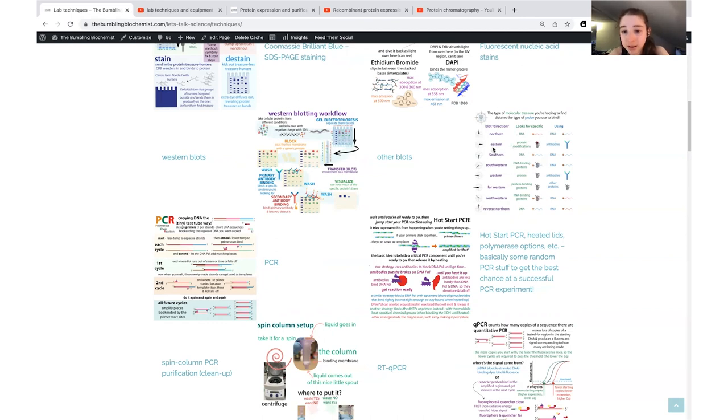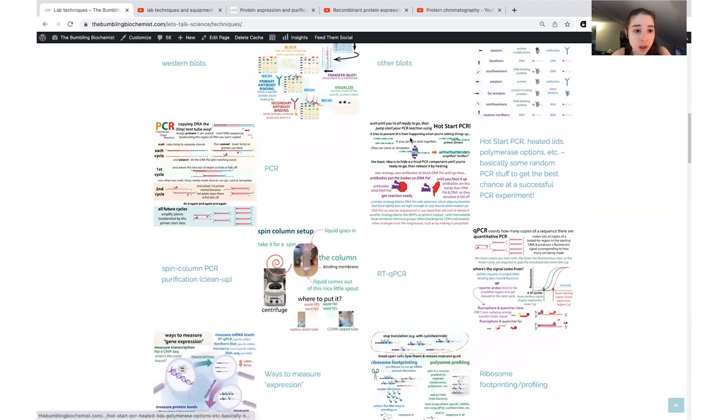And the Southern blot is actually the original blot, where you have DNA. You'd run either some sort of PAGE or agarose gel, transfer that DNA onto a membrane, and then probe it with DNA. There are also a bunch of other methods. In my post on the blots, I go over the Northern and the Southern in the most detail, but there are other ones where you're looking for other types of things.